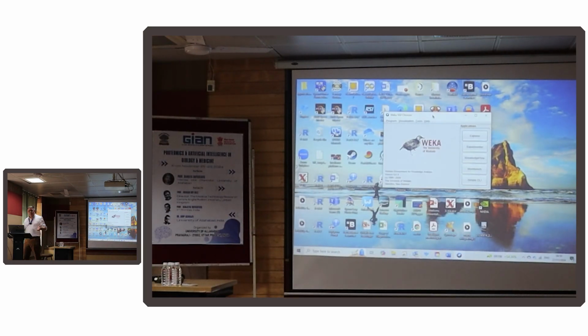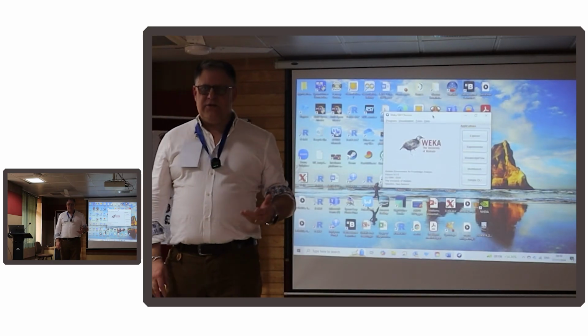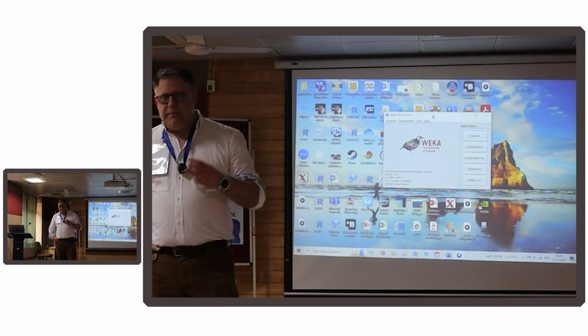So now we're going to go on to Weka itself. Obviously, just for those who are watching and are not in the room, I've just been talking around the package manager for Weka, referring to deep learning packages.